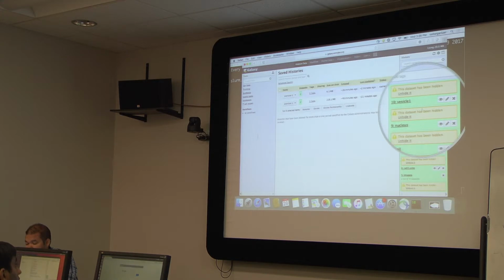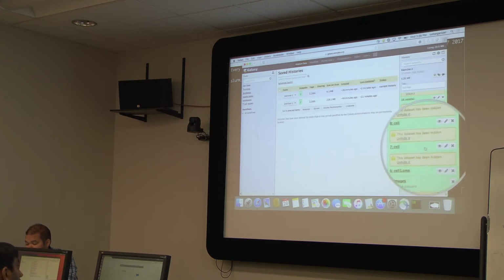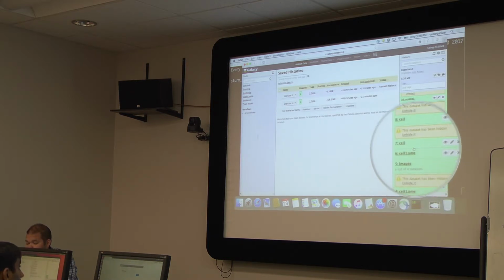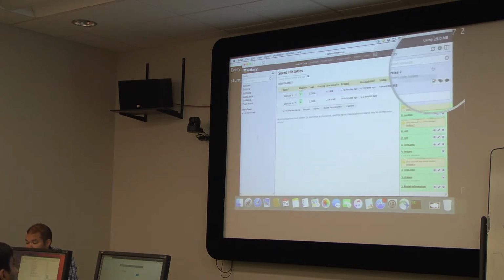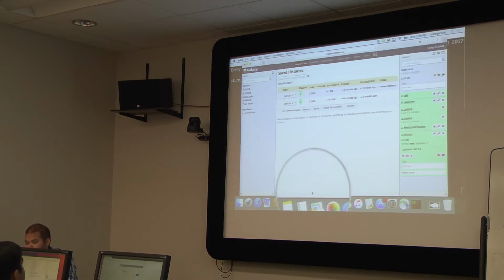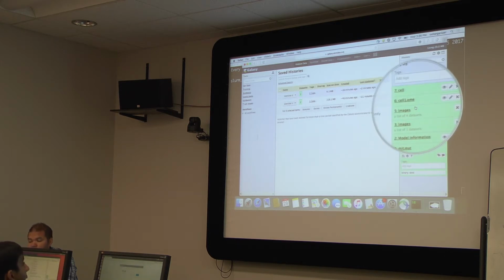So now I'm going to go to Cell OME, unhide it, and I'm going to go to Cell and unhide it. So I'm going to go back to the top and select hide hidden, and then everything goes away. And now in my history, I have those 2 files that were part of the images data set.